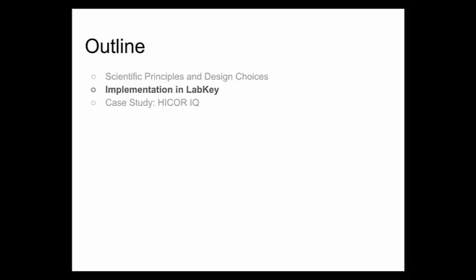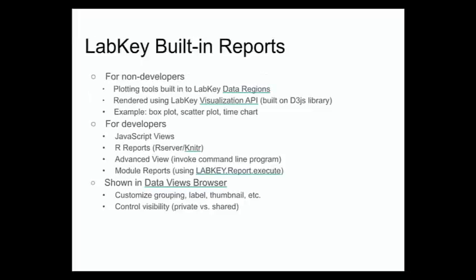All right, thank you. So I'm going to spend most of my time going through a live demonstration, using the demo study from labkey.org. I have it on my local machine here. And we can count how many of these tough rules I broke from the examples I'm going to show. But I did want to have a couple of slides just to list out the information for reference.